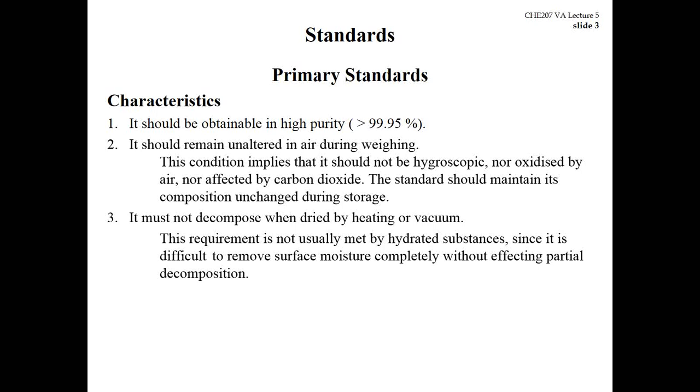Even if we keep the chemical in a very tightly closed container, over time it absorbs some moisture from the atmosphere. So that must be removed before the compound is used. We remove it by drying in the oven or using vacuum.